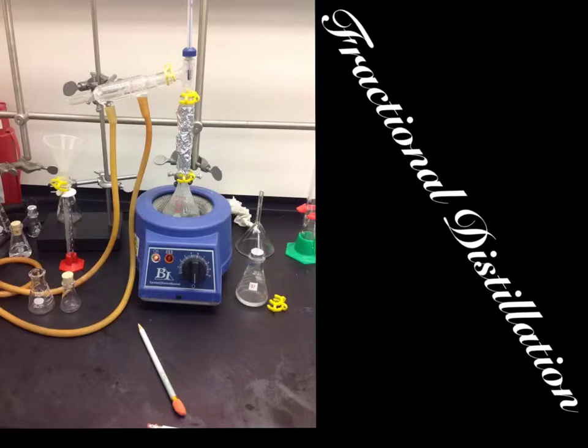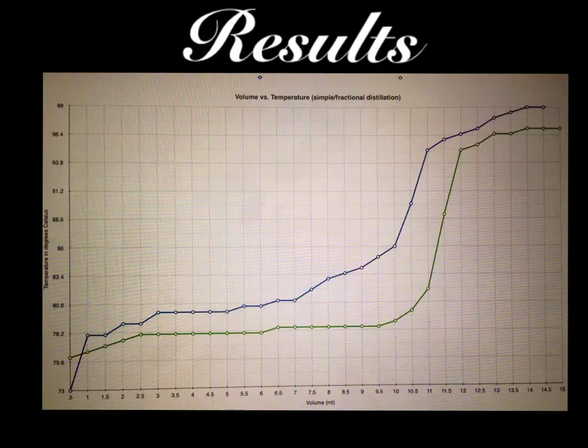to the distillation flask. Each time water vapor climbed, condensed, and returned to the flask was considered one cycle, as in simple distillation. The major difference in fractional distillation is that water vapor is constantly climbing, condensing, and returning to the distillation flask, allowing for multiple cycles and a richer distillant.